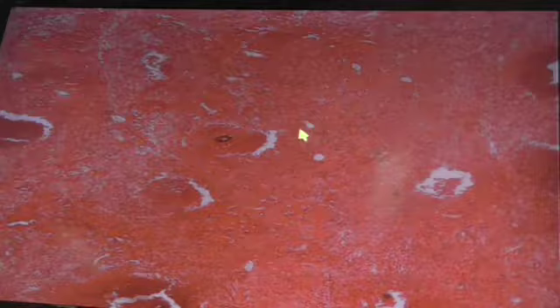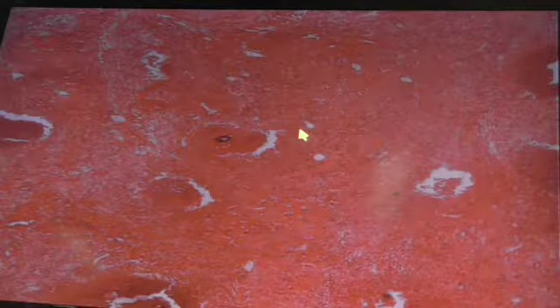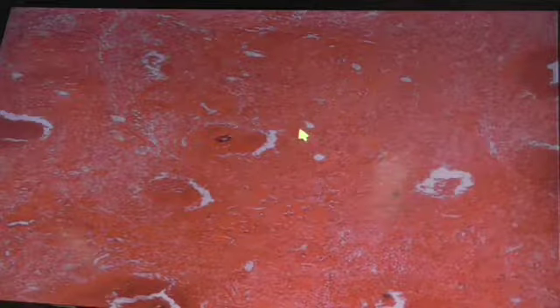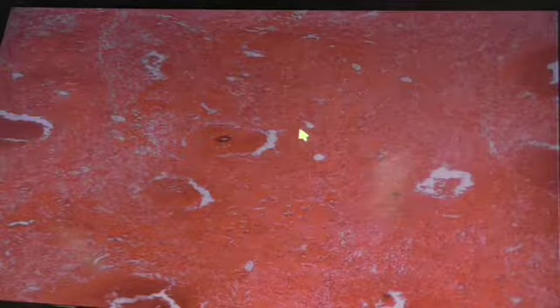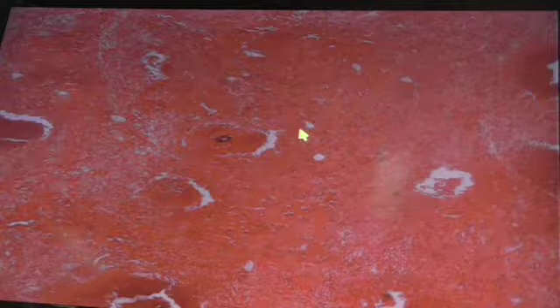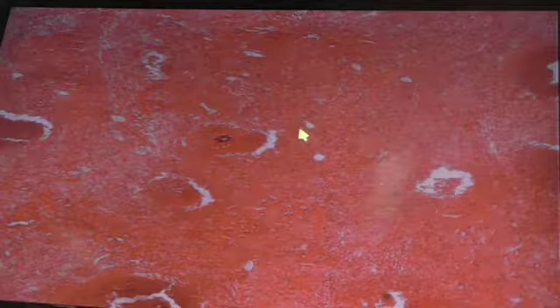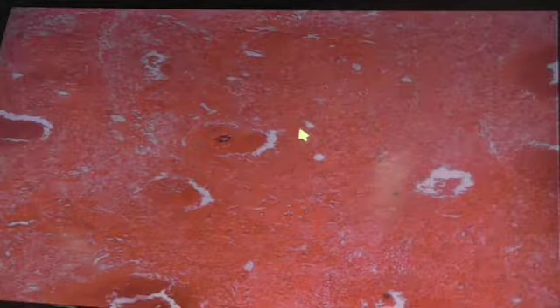Okay, mononuclear cells. So now when we say mononuclear cells, we think of what cell types fall in that category? Macrophages, plasma cells, lymphocytes. What about macrophages? You see that, right? Epithelial cells, slash macrophages. All right, so you see all those types of cells there? What would you say was the most predominant cell type there, though? Neutrophils.